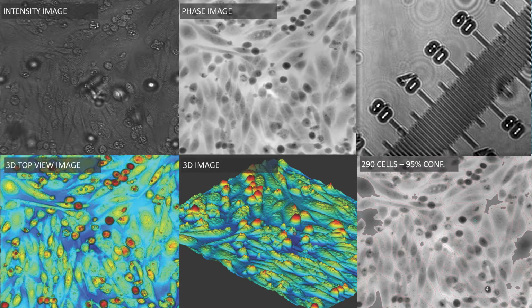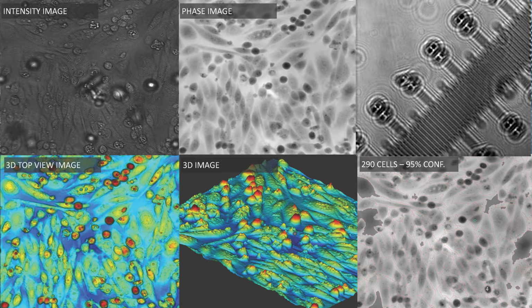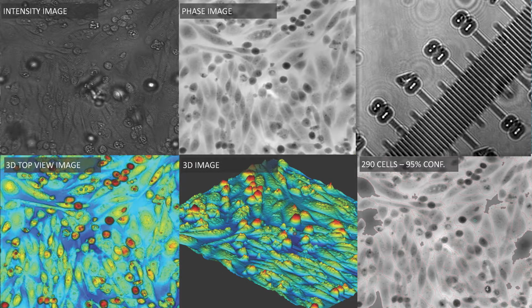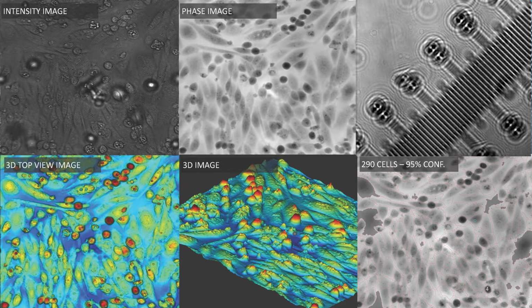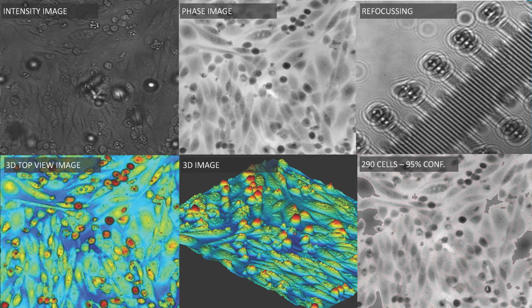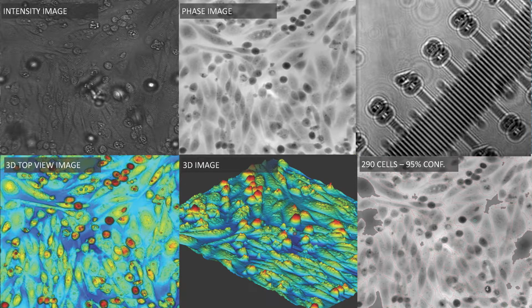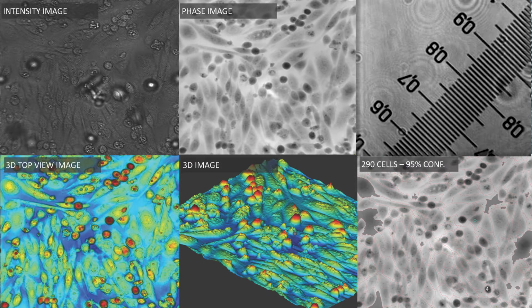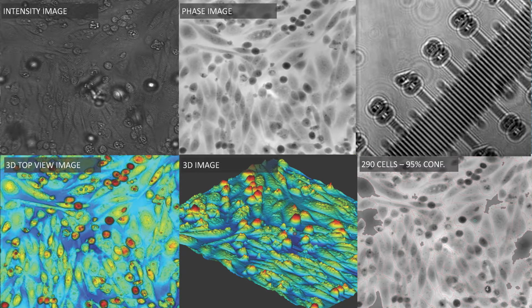The 3D holographic image, which you see in the bottom middle and the bottom left in a top view, is where we extract most of the information. On top of that, we are also able to refocus on the cells that are not completely in focus once the image is captured. The refocusing capabilities you see playing in the small video on the top right.